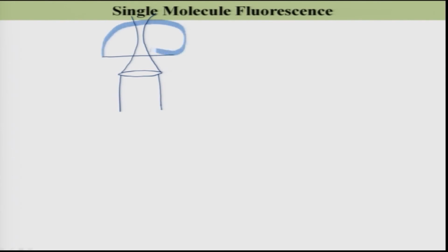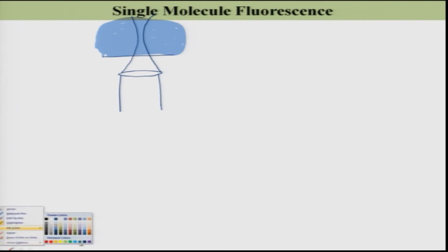The whole position is your sample position; your sample is present all along on top of this sample stage, and this excitation light, let us say, is like this.